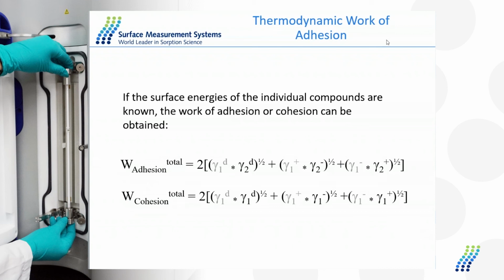I would say we have seen that in the past. I would not say it's an across-the-board rule. And it's also not necessarily an across-the-board rule that the lowest thermodynamically stable polymorph has the lowest surface energy.